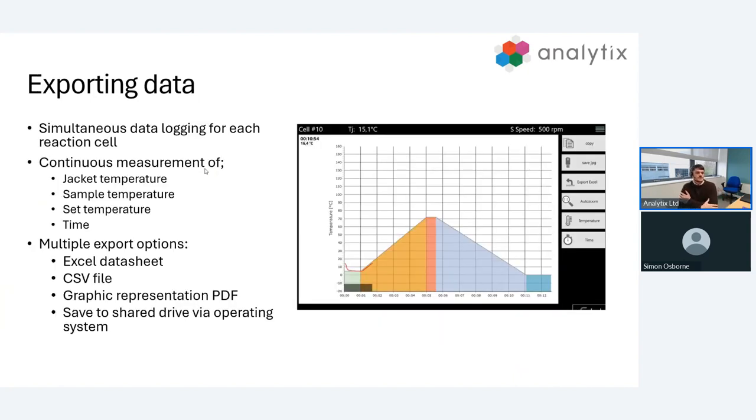Exporting data is a really strong factor with Excelsis. We have simultaneous data logging for all 10 of the reaction cells throughout the reaction, with continuous measurement of jacket temperature, sample temperature if we're using external thermoprobes, the set temperature or target temperature, and the time. You can see the graph on the right there. This is what you'd be able to see mid ramp cycle. You can see we're about at the minute and a half time point. The red trace is your jacket temperature and it's following the set temperature of our ramp with the different color coded stages.